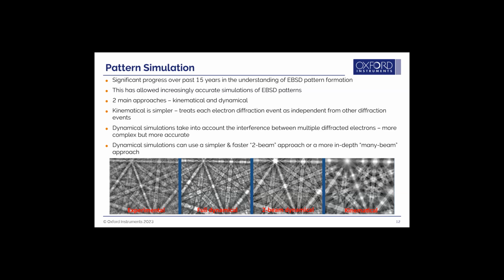You can see it takes into account the multiple diffraction events and really builds, ultimately, a better picture. It's easy on your eye to even look at it and say, that looks more representative of the patterns that I see when I run the system. The only difficulty is dynamical simulations are a little bit more difficult to produce. They take a little bit more time on the computer.